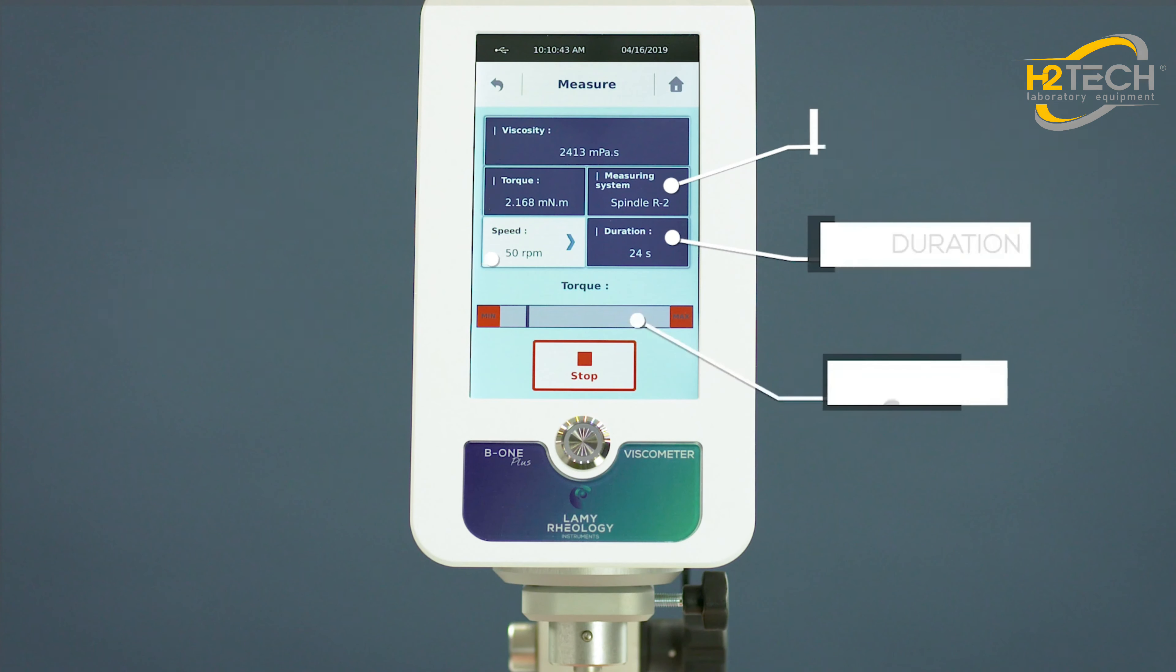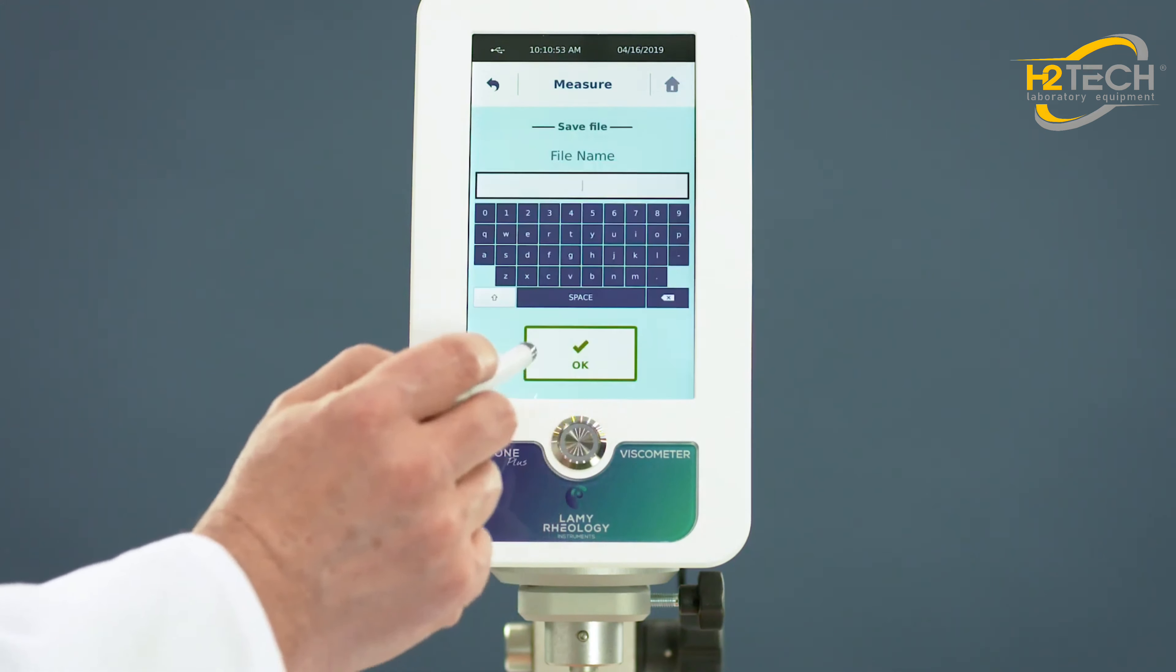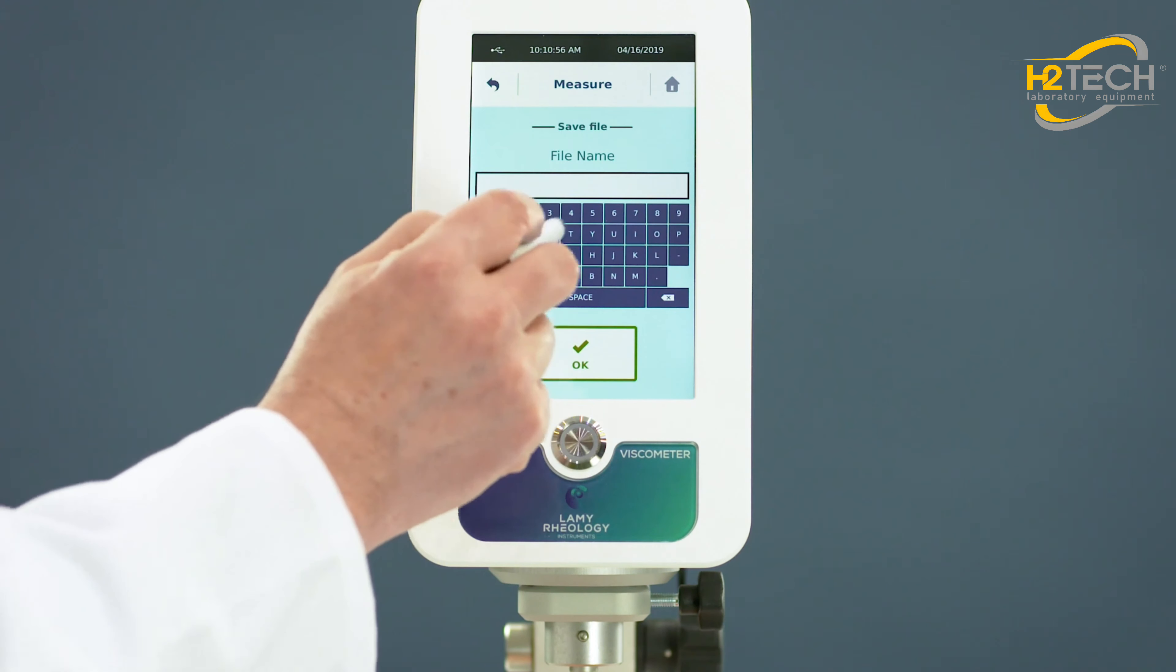A gauge allows you to see if the torque is not too close to lowest or highest limit of the device. After the test, you can save all data in the device's memory to be read or exported later.